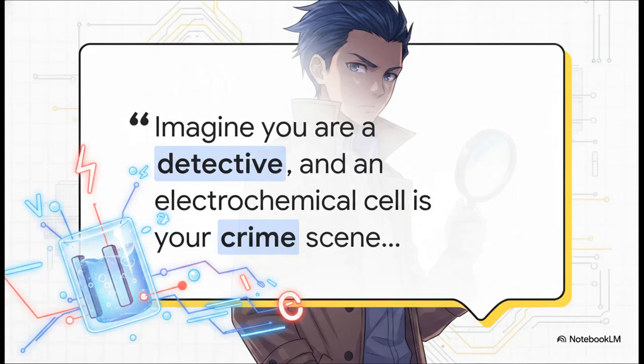To really get a feel for how this complex technique works, I want you to picture this. You're a detective. But your crime scene isn't a typical room. It's an electrochemical cell. It's this microscopic, sealed-off world that is in constant chaotic motion. And here's the catch. You can't just crack it open to look inside, because doing that destroys the very environment you were trying to study. Plus, the clues we're hunting for aren't physical fingerprints or footprints left in the mud. They are electrical signals. We're literally tracking how voltage and current interact over time to reveal the hidden mechanics of this microscopic world.